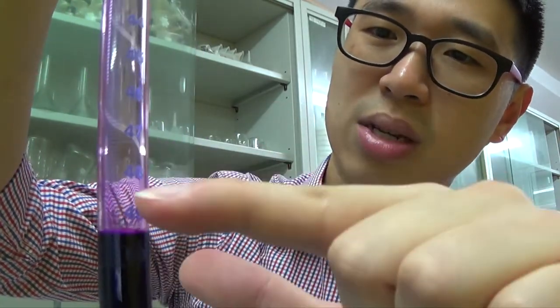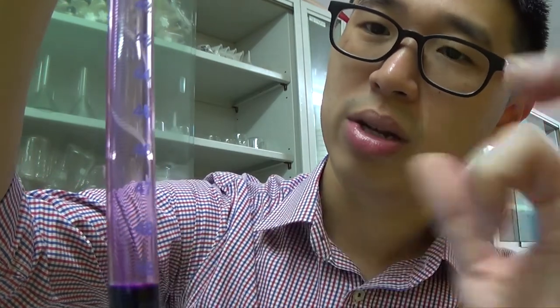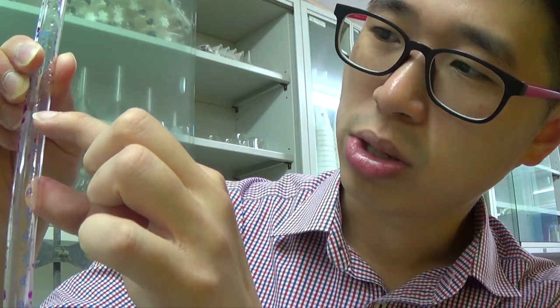Because we read above the meniscus for the starting volume, we also read above the meniscus for the final volume at the end point. So usually, school will tell you to fill up to zero, but because it's so hard to reach exactly zero for KMnO4, you can fill up anywhere, as long as it's filled reasonably to the top and you can read the reading, that should be all right. This is titration. As long as you know the starting volume, you'll be all right. When you have an end point, you can just subtract it from the starting volume, and that's why you must record what was the initial volume, what was the starting volume you used, all right?